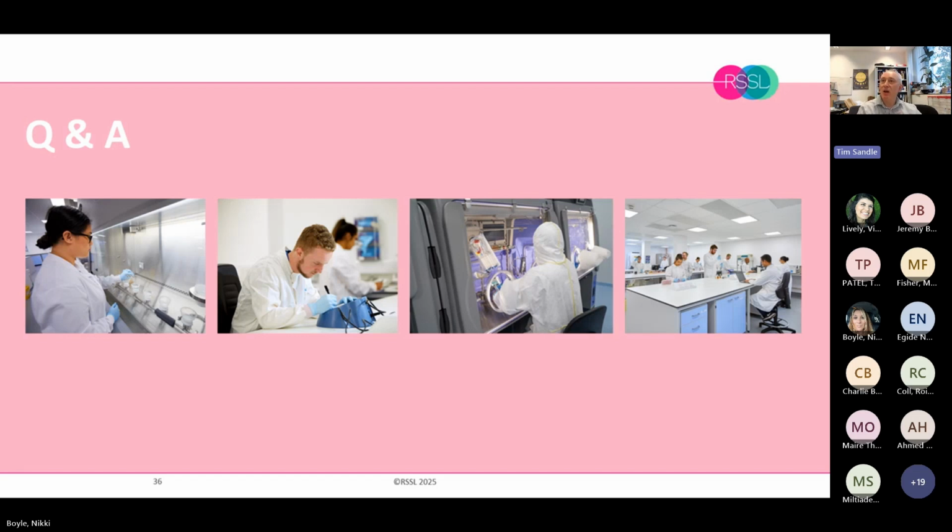Sporicidal disinfectants are designed to kill all life forms. Therefore, they're all nasty chemicals. Often people will say that's really pungent, or I have to wear a respirator, or anything else. But some of the things like hypochlorous acid are probably a little bit safer. But these are all quite nasty and aggressive chemicals because they're designed to wipe out everything.